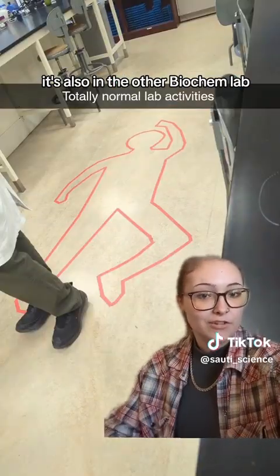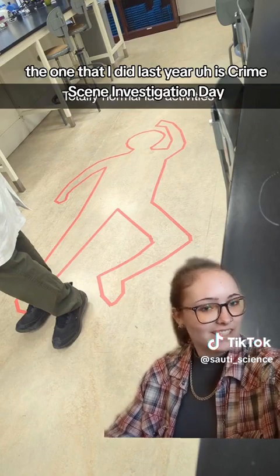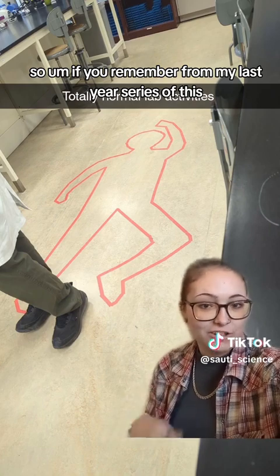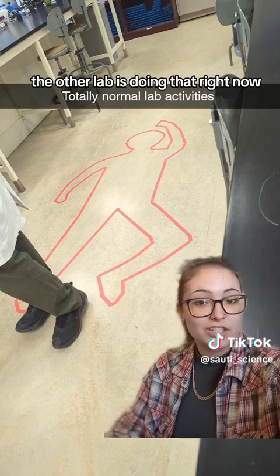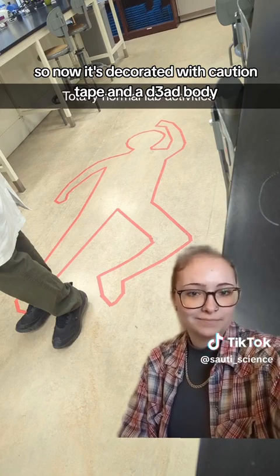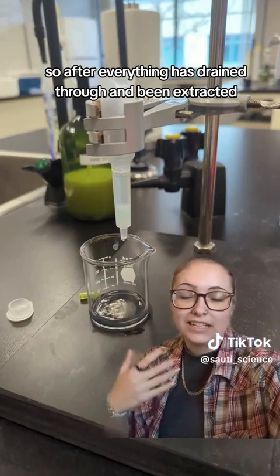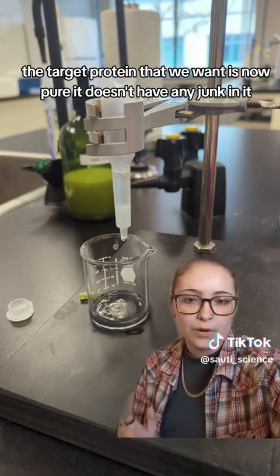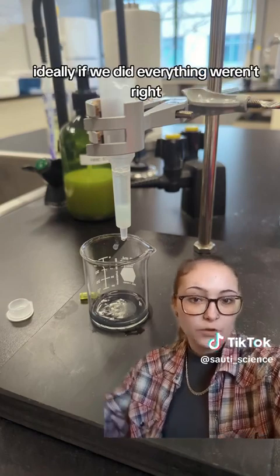Also, in the other biochem lab — the one I did last year — it's Crime Scene Investigation Day. So the other lab is doing that right now, and it's decorated with caution tape and a dead body. After everything drained through and was extracted, we were left with purified proteins. The target protein we want is now pure — it doesn't have any junk in it, ideally, if we did everything right.